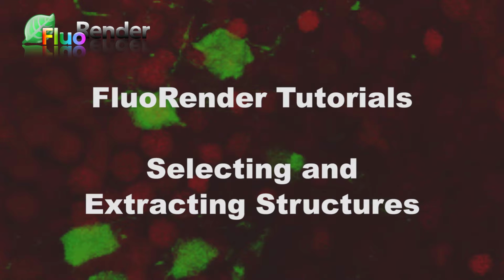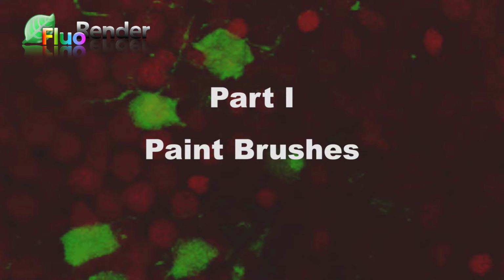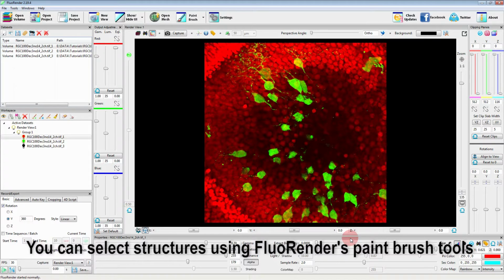FluoRender tutorials. Selecting and extracting structures. Part 1. Paint brushes. You can select structures using FluoRender's paintbrush tools.